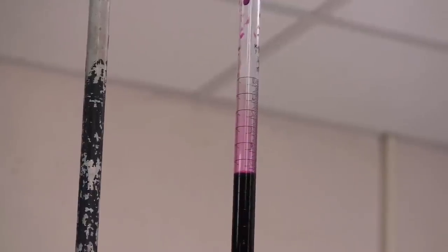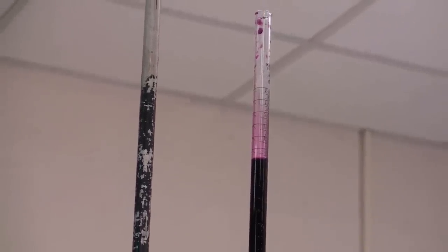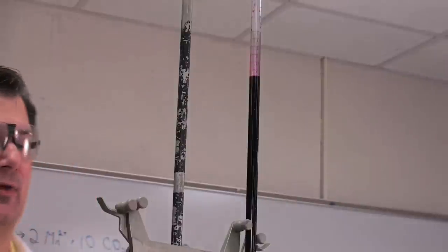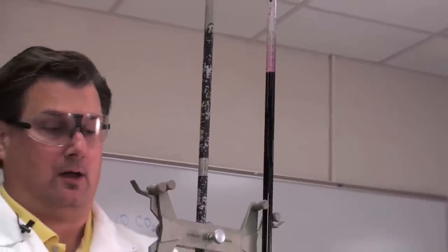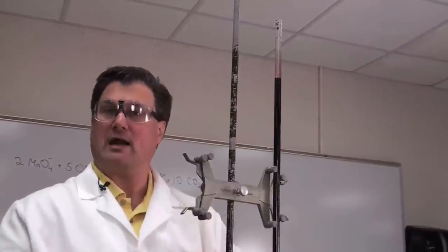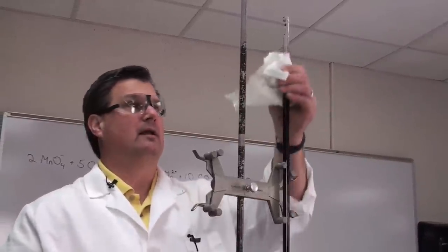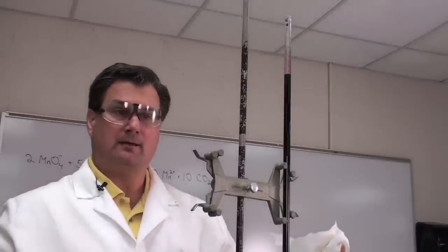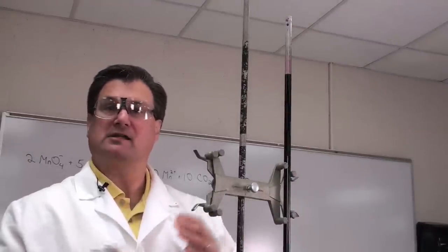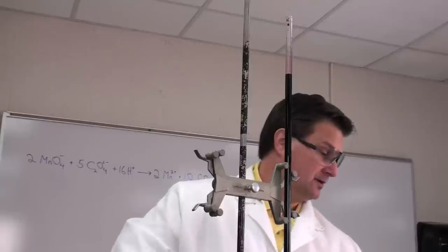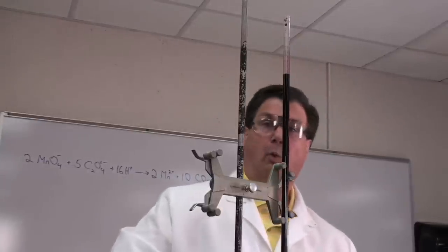It's a better idea not to shoot for exactly zero. Why? Because if we're shooting for a particular target, we're often predisposed to think we've hit that target. It's better to just fill to somewhere near the top and then objectively read the point to which we filled. Since volumes are measured by difference, it doesn't matter. Zero minus five is the same as one minus six, so it's not critical what we fill it to.